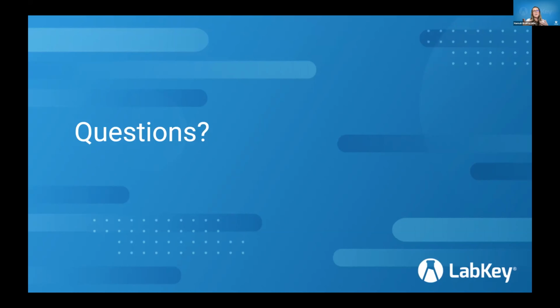LabKey, somebody's asking about migration services, and yes, we do offer data migration services. If people are moving from more standard systems to LabKey, we have a good sense of what those data structures are. We continue to learn, and every lab is different, but we do offer those services as well for groups that want to use them.